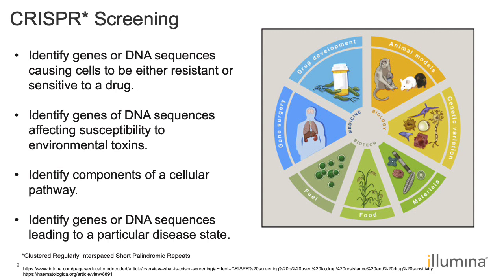However, in this presentation, we will focus on what is called CRISPR screening, which is essentially a large-scale genetic loss-of-function approach designed to find the equivalent of a few needles in a haystack in the world of biology. And we will mostly focus on pooled CRISPR knockout screens, but this method can also be employed with transcriptional inhibition or activation with CRISPR-I and CRISPR-A.